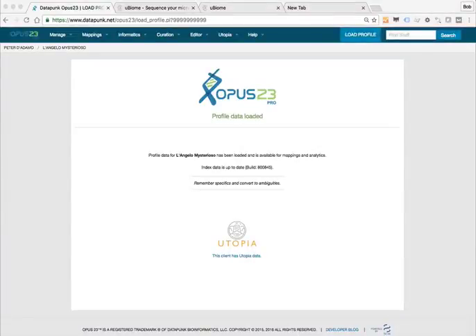Hello, I'm Peter D'Adamo and Tara Nyack and we are working together to prepare this short video to show you some of the interface associated with the uBiome module in Opus 23 and a quick tour of some of the basic apps that are provided in the program. uBiome is basically a free add-on module that allows you to look at microbiome raw data as supplied by the uBiome service.